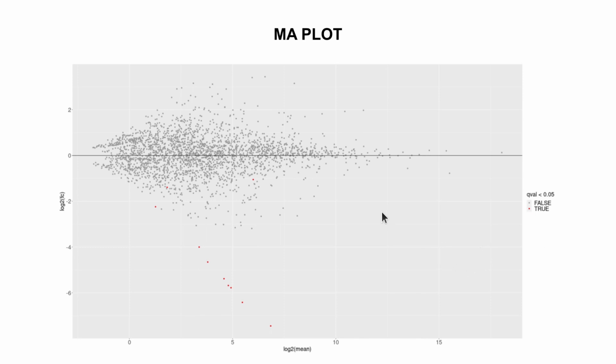With MA plots, the up and down regulated genes are at the extremes. So at the upper part here will be the up-regulated genes or transcripts. In our case, we are dealing with transcripts. This plot is for transcripts. So the upper region here will be for up-regulated transcripts, and the lower region here will be for down-regulated transcripts. And in the middle here are those that are not differentially expressed. Using the data we have and the color schemes, you realize that all the transcripts are in this region. And so this means that these are down-regulated transcripts.